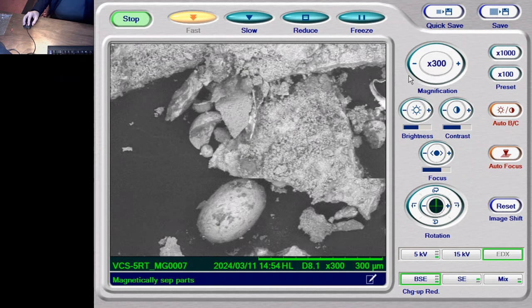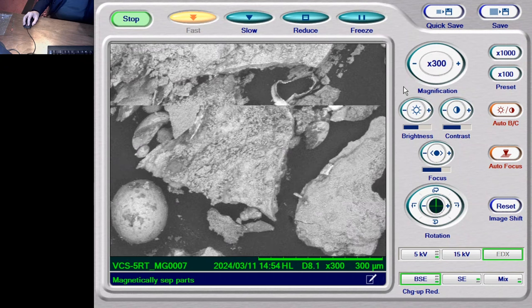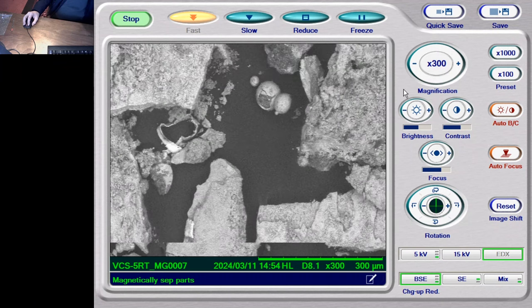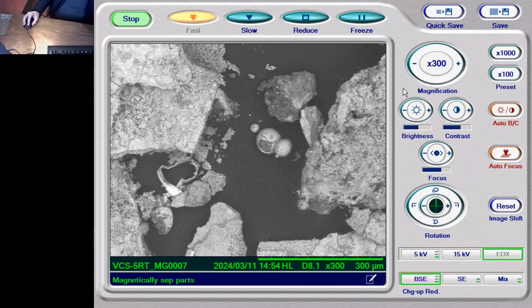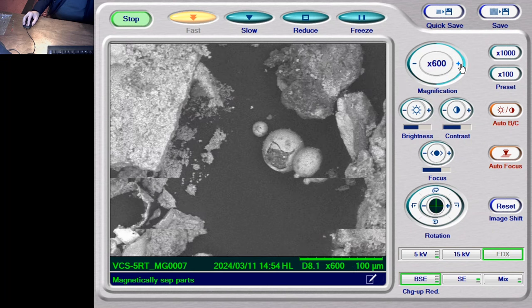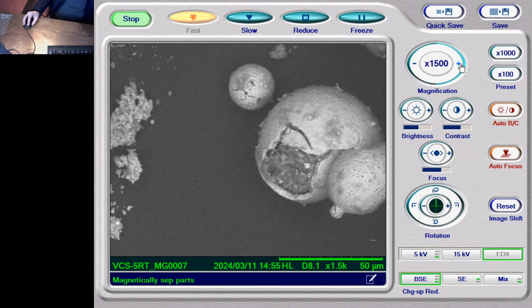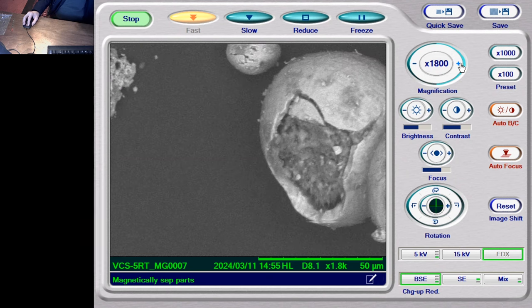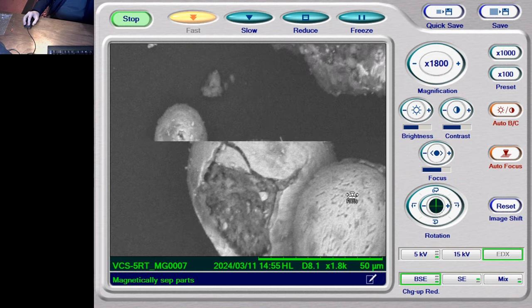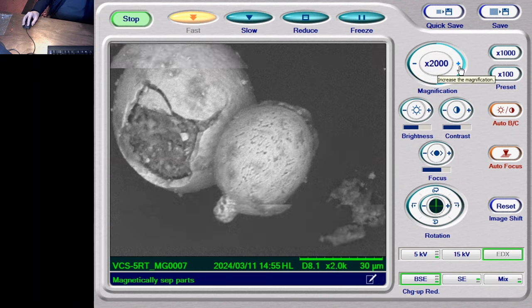So large chunks of this are agglomerations, it would appear. Oh, look at that up there. What is that? What are those little things there? This looks like a hollow one, which has been then filled up. Okay. So this here is typical, in my view, of something that's got some impurities in the iron.